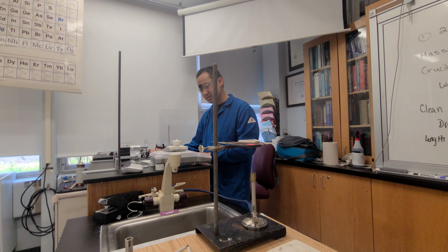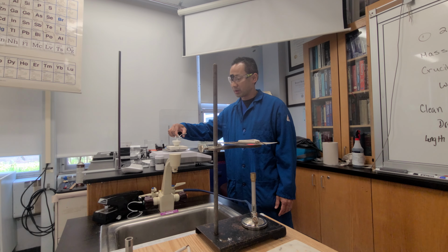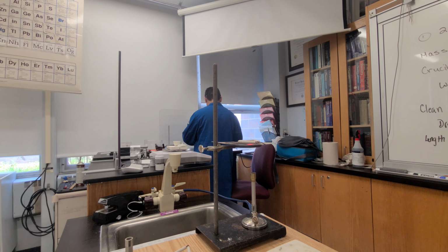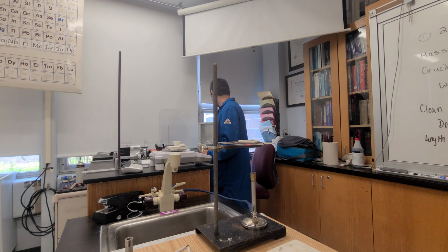And again, I just tried to elevate that to do that. So 37.97, that's a good solid measurement. Okay, it's cooled off a little bit. I'm going to do this one as well, since I found out that it worked. I'm going to take my magnesium, drop that in there. Okay, 38.16. Critical. 38.16 grams with magnesium and crucible.